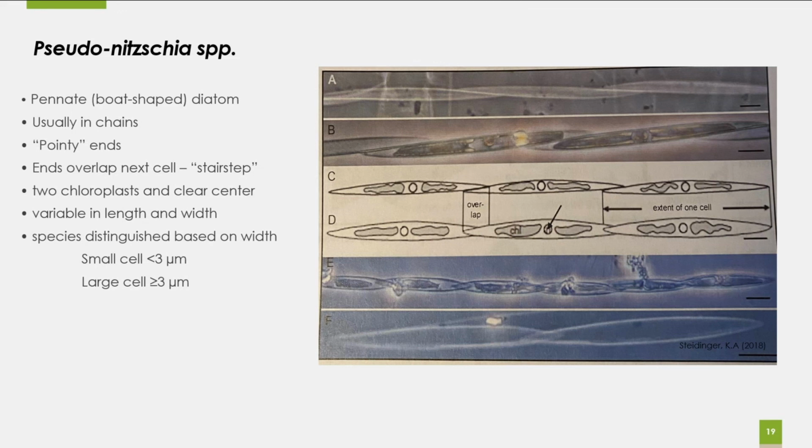That's a general rule we go by. We used to identify small, intermediate, and large cells, but that got very difficult, too time-consuming, and too much of a headache. So we lumped the intermediates in with the larges, and that's how we categorize them.